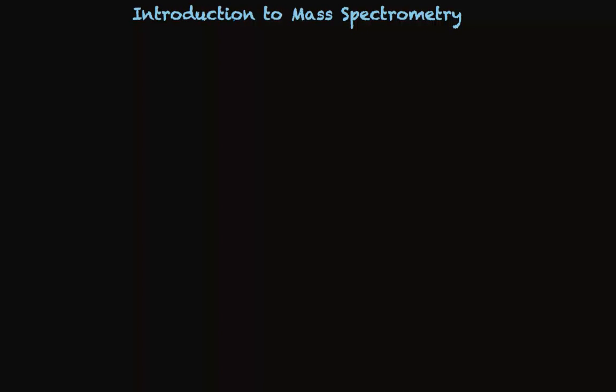Mass spectrometry is an extremely powerful tool for identifying the structure of organic compounds. It seldom provides enough information to identify a compound with a relatively complicated structure all by itself, but it gives extremely useful information. Here are some key points.